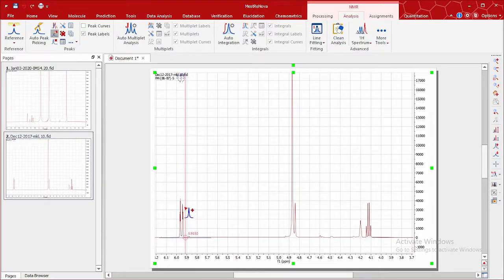In this feature, we have to be very careful with the kind of peak we are picking. This is how to pick our peak using pick by pick. Make sure it drops a circle on top of the peaks before you start picking. So you can go on and on using pick by pick to pick all the peaks you want. This manual picking and pick by pick gives you the advantage of bypassing picking a peak that is not necessary for your Proton NMR.